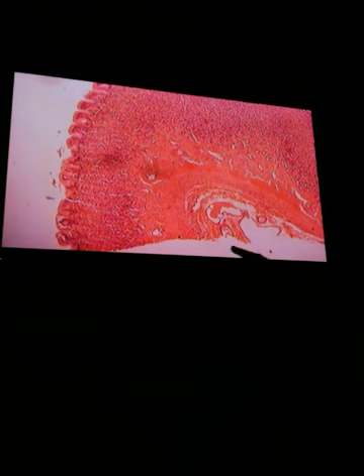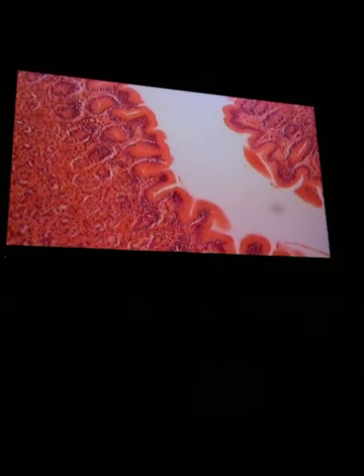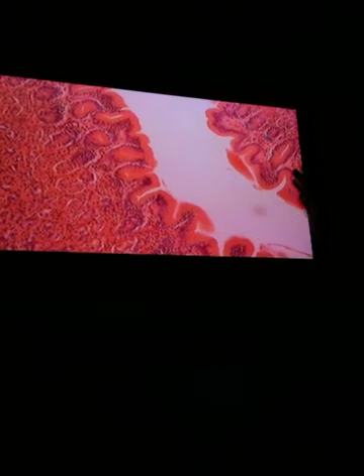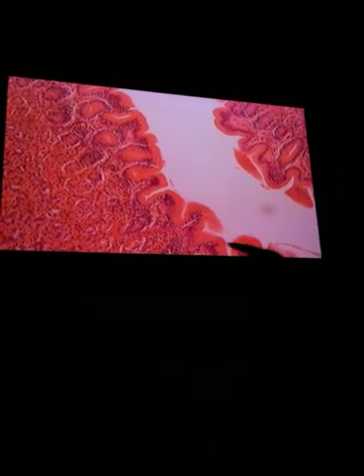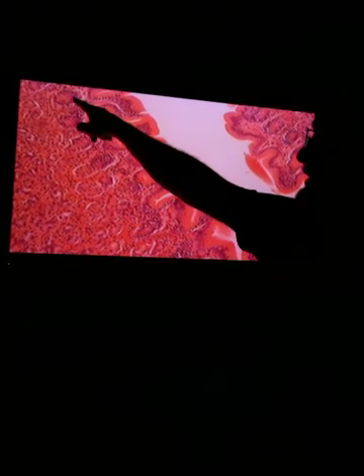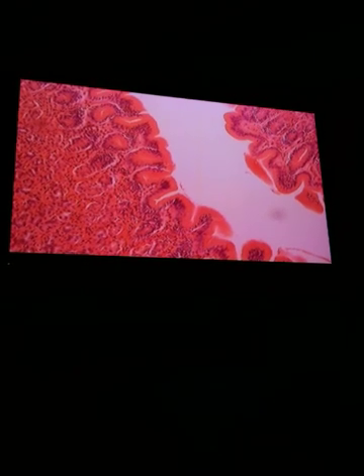If they want you to identify a pit or what kind of tissue it is, they're probably going to pop it up to something more like this, where you can actually see the simple columnar, you can see the actual rugae and the folds. Like here's the gastric gland, gastric gland, gastric gland. Can you see those? Those are the gastric glands that actually secrete up in there. All right.